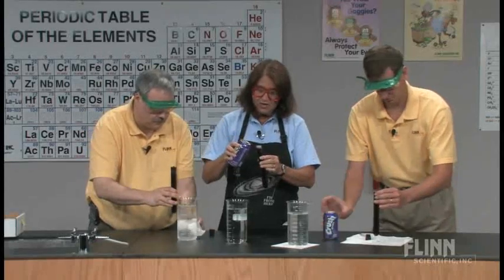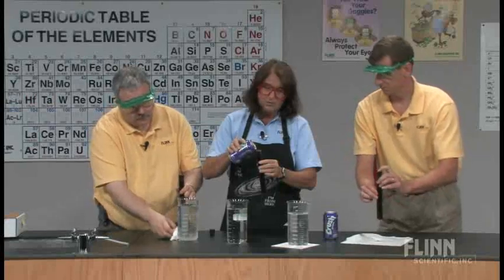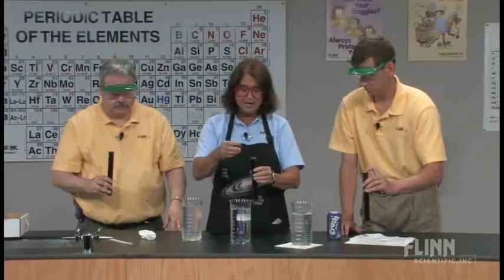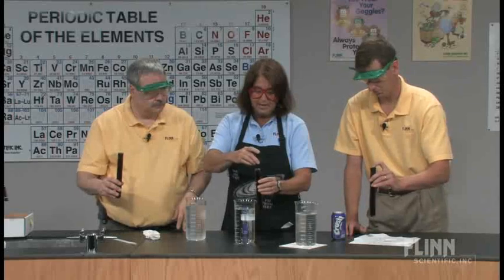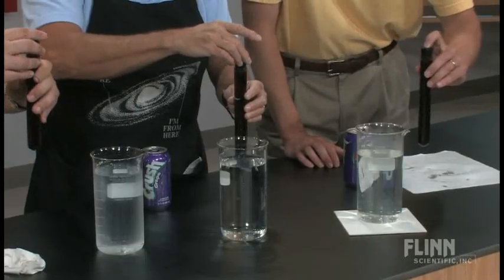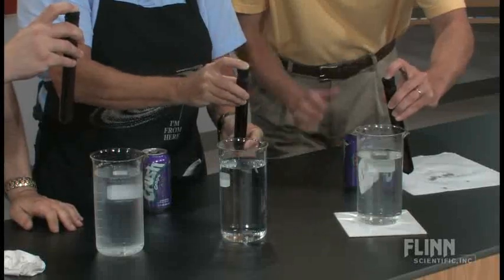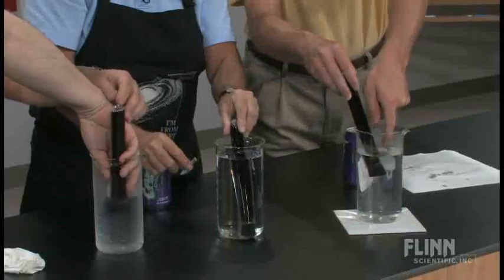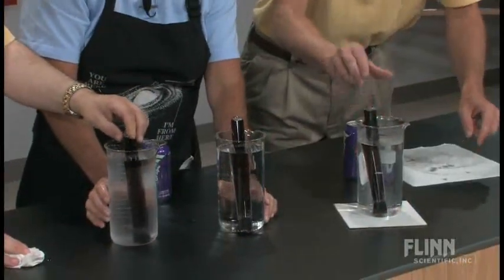You can make this more quantitative if you predetermine exact temperatures for your hot, room temperature, and cold — it might work nicely with 10 degrees hotter and 10 degrees colder. All we're going to do is place our fingers over the stopper, invert it beneath the surface of the liquid, and take it all the way down to the bottom.